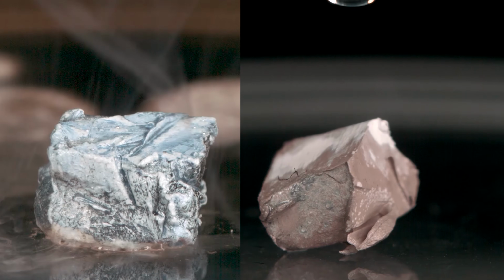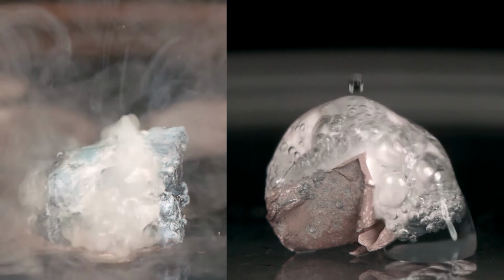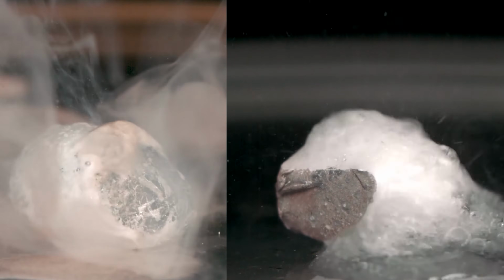Here's a direct comparison between potassium on the left and sodium on the right. You'll see the potassium reacts immediately. It starts to melt. It's consumed in fumes and reaction products immediately and is much more reactive than sodium.